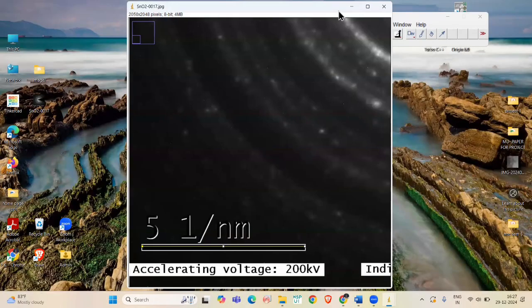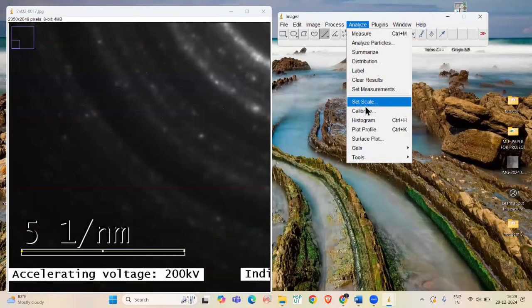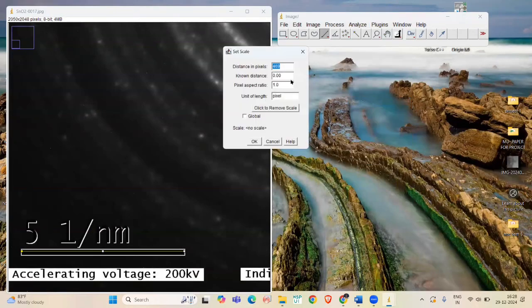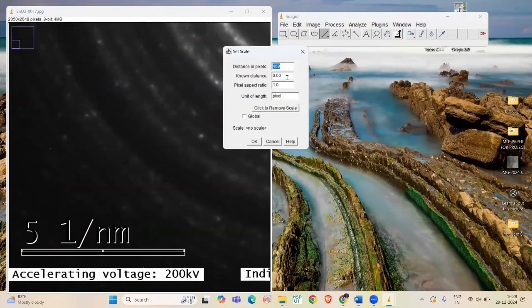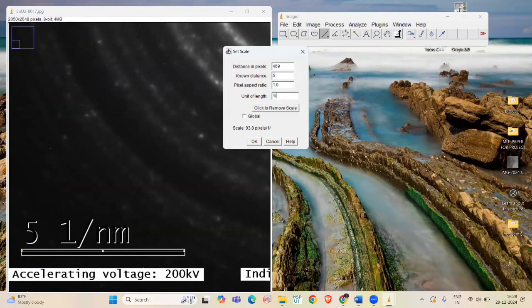Now, go to Analyze and select Set Scale. Set known distance as 5 and unit of length as 1 by nanometer. And then click OK.